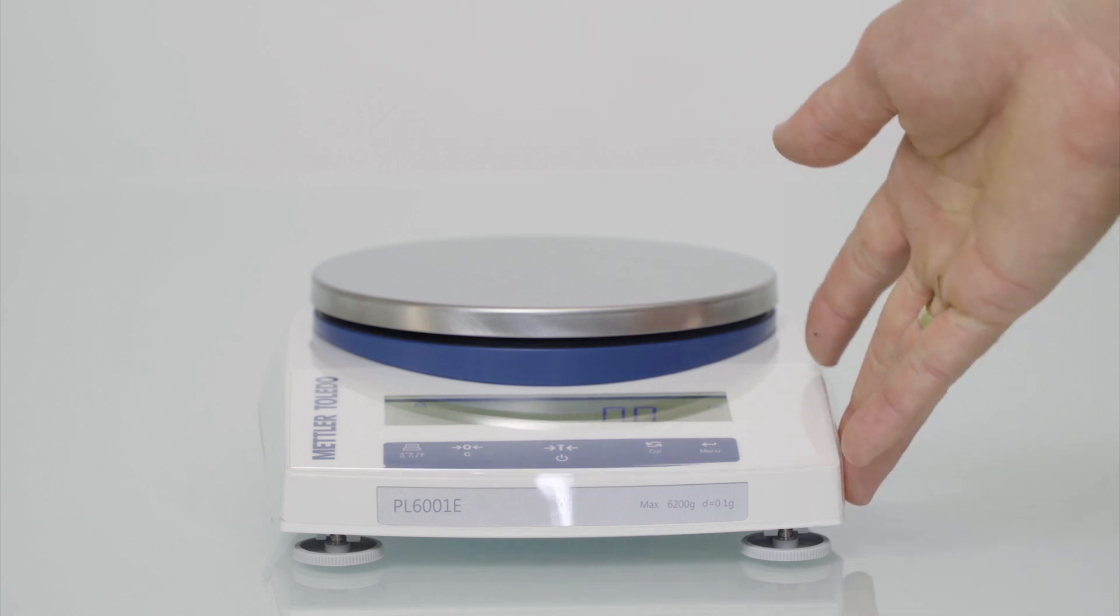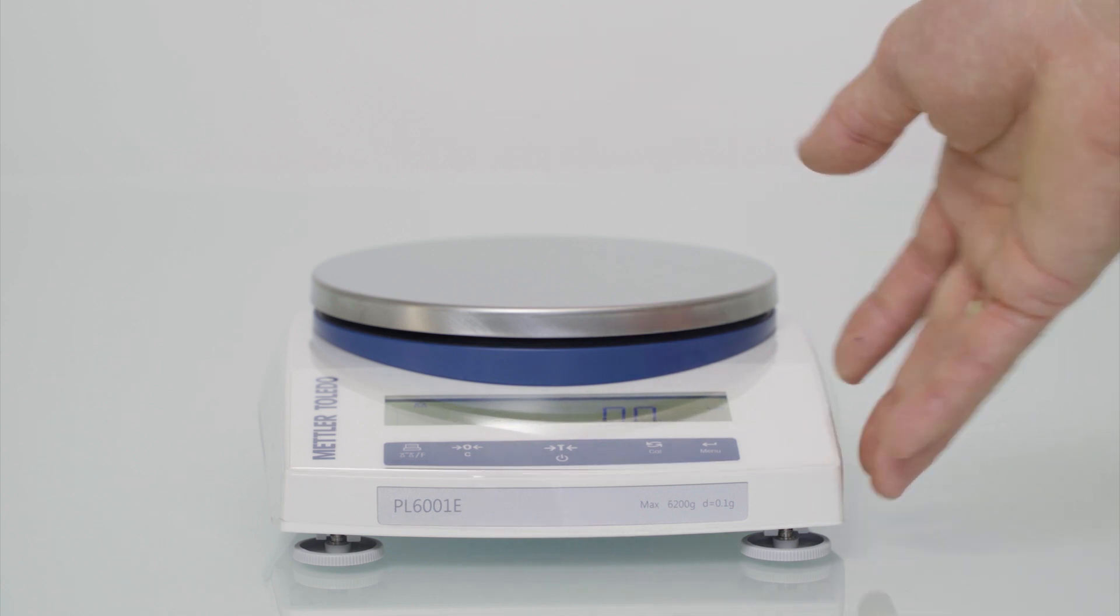Each balance also comes with a protective cover which protects the balance from scratches and contamination. Both covers are included with each PLE balance you purchase.